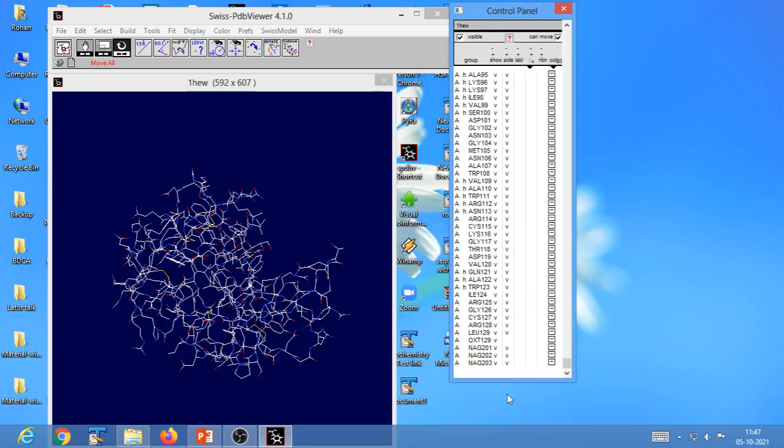how the hetero groups are arranged at the end of your PDB file. Hetero groups are conventionally placed at the end of the list, at the bottom of the amino acid residue list or the participant list in your protein structure. Now the trinag inhibitor is listed as 3 residues of NAG.